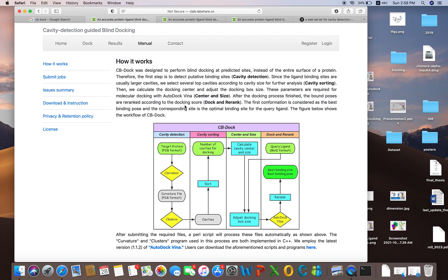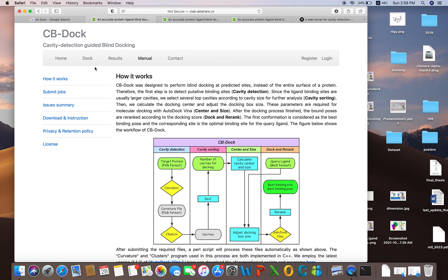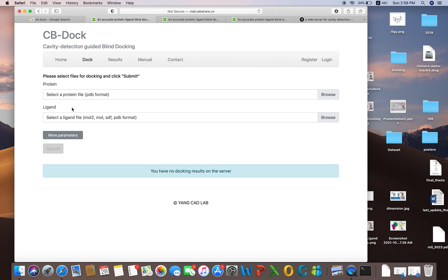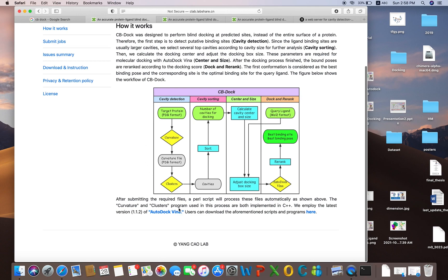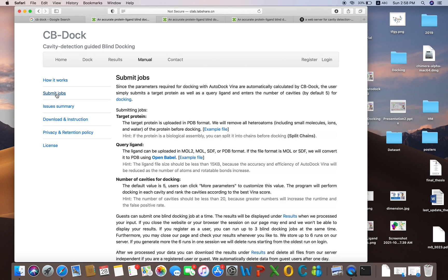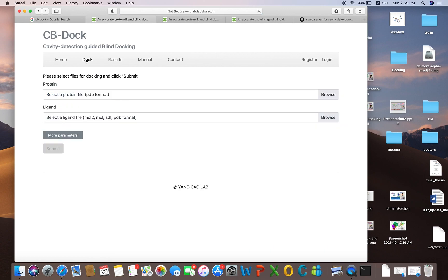If you are interested in protein-ligand docking, this is a very good server which you should use. To start docking, you click here. If you have some queries, you can click on the manual, which lays down how it works, how it sorts the cavities, how it calculates the center and sizes, and how it detects and ranks the binding pose using AutoDock Vina.